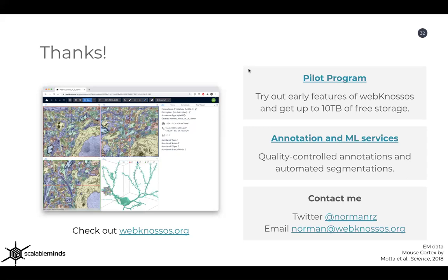Yeah. So we do that occasionally. For example, when dealing with neurons again, what we oftentimes do is run a type classifier on that, and that will give us some information about basically what part of a neuron we're currently looking at. For example, is it an axon, a dendrite, or a nucleus or something, and then we can attach that information to a segment. So yeah, that's something that we do, and it also helps for other parts of even the segmentation process itself.